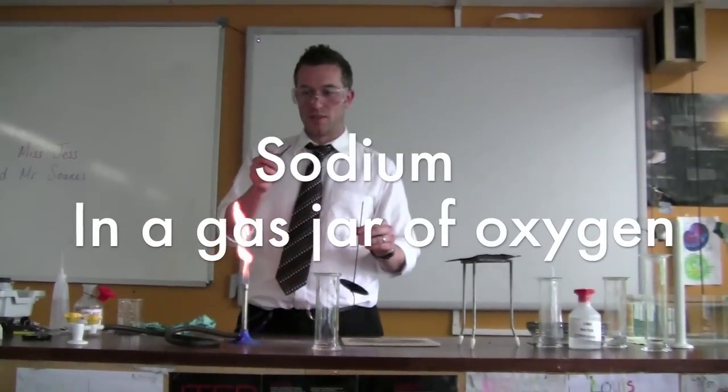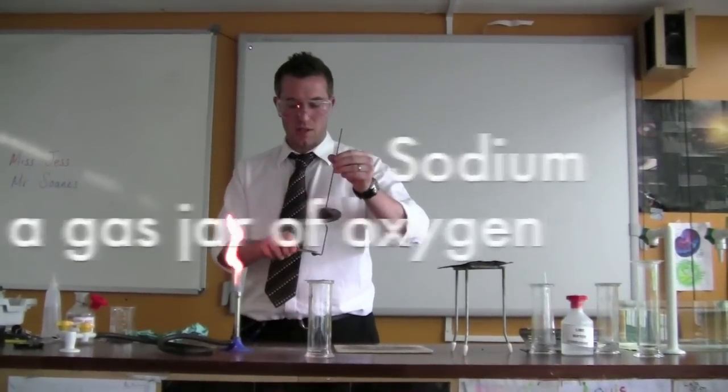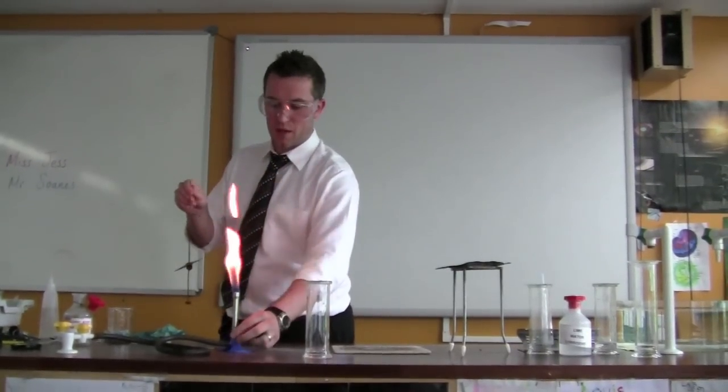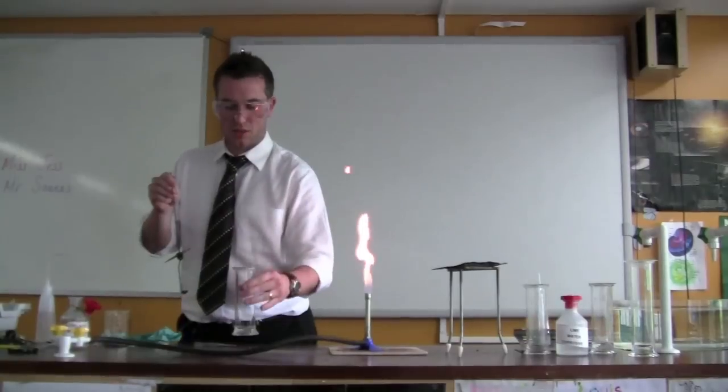Okay, sodium. Take a small piece of sodium, cleaned up all the oil. We're going to put it on this spoon. Again, we're going to need a roaring flame. And here we have a little jar of oxygen.